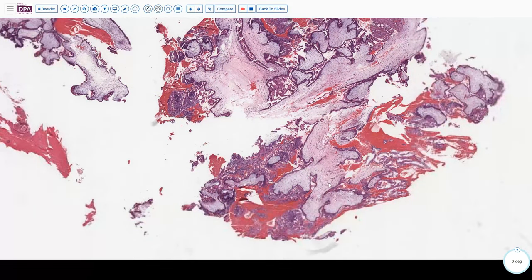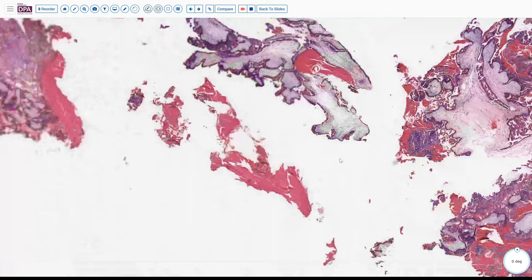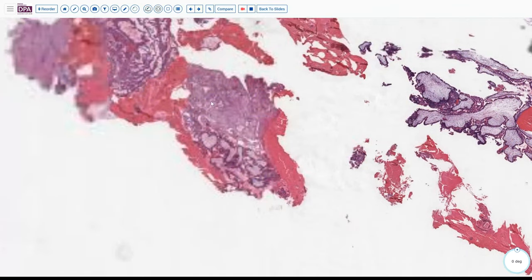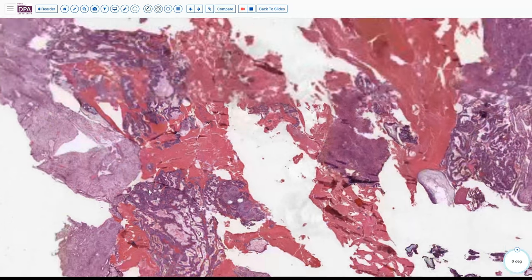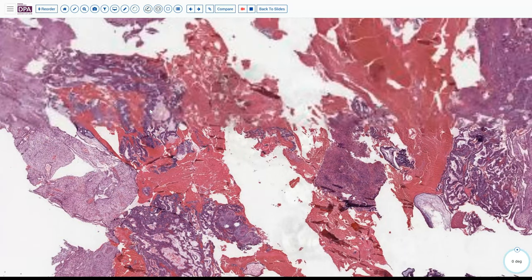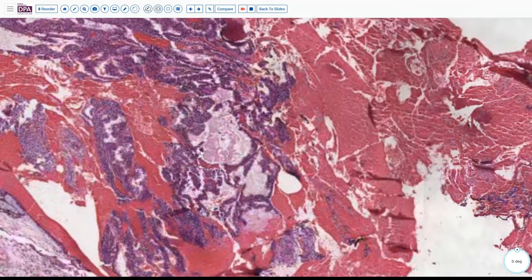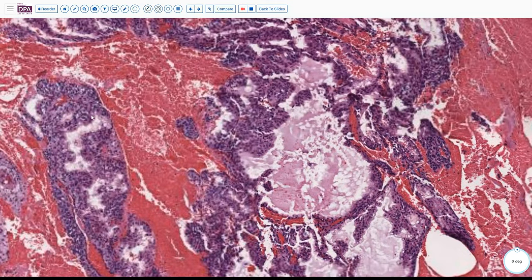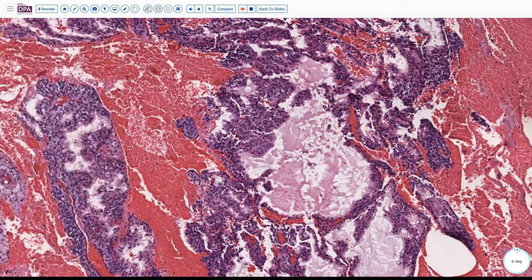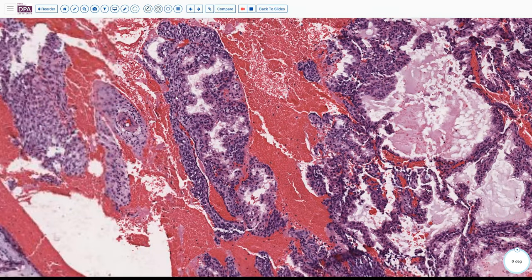So is this something to be concerned about? Is this just an abortus, an empty sac, a blighted ovum, or is there something potentially more ominous brewing in these materials? Here we see a little bit more of the Arias-Stella reaction that we've talked about before, right here in this field.